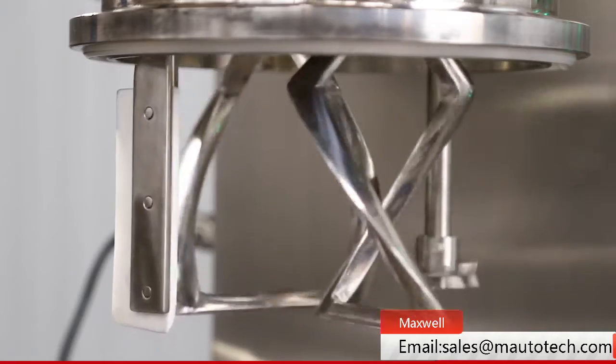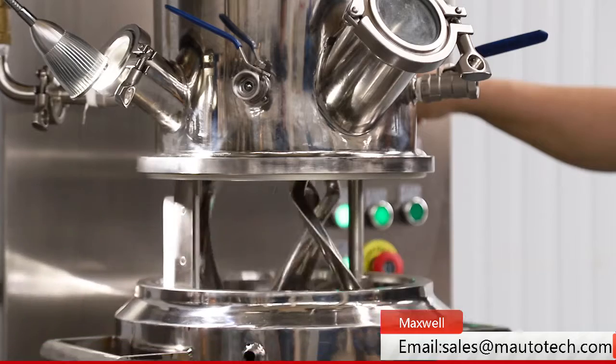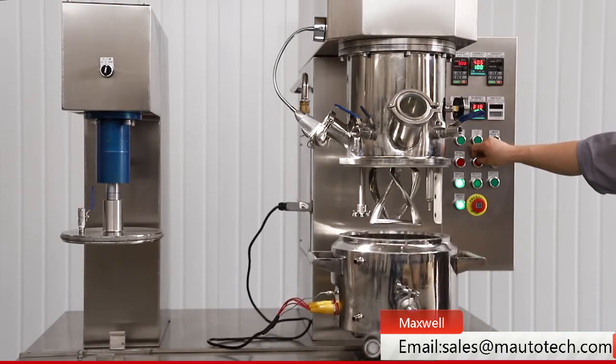The machine has one extruder on the same platform. With it, product can be extruded out from the tank outlet. This machine is the best choice for laboratory operators.